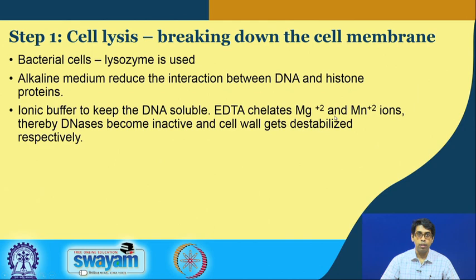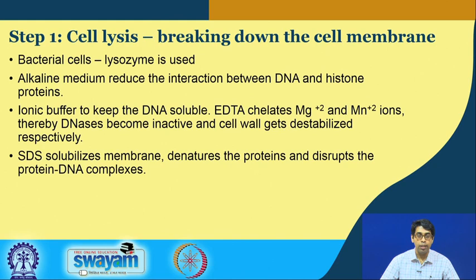So these are the ions which are removed so that different enzymes such as DNases, which can break a DNA, which can chew up our DNA, are inactivated. Also adding EDTA makes the cell wall of the bacteria unstable. So it helps in both degrading the bacterial cell wall and also protecting the DNA from several enzymes.